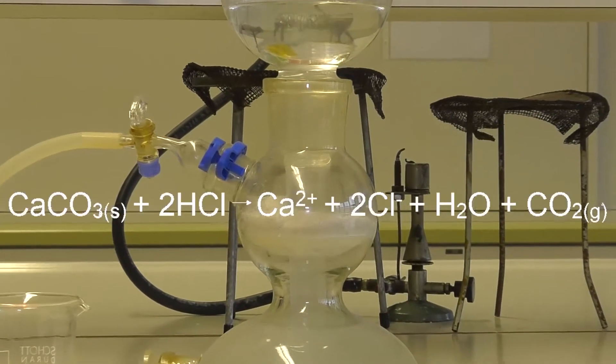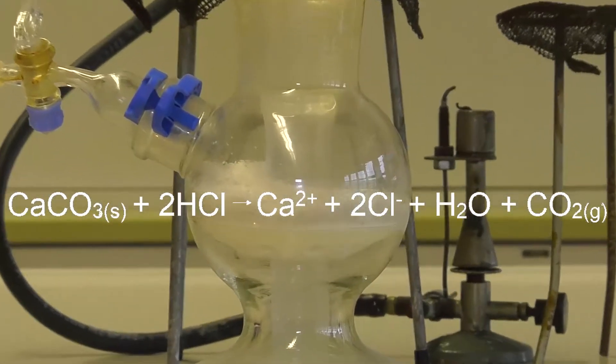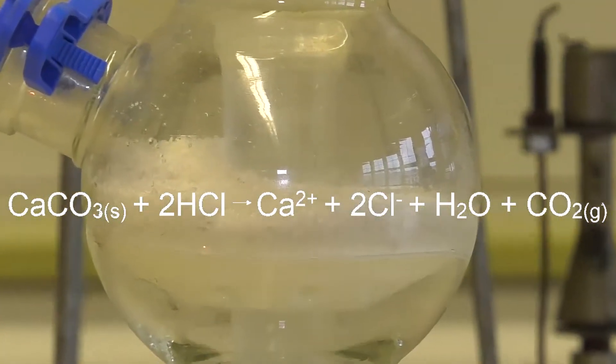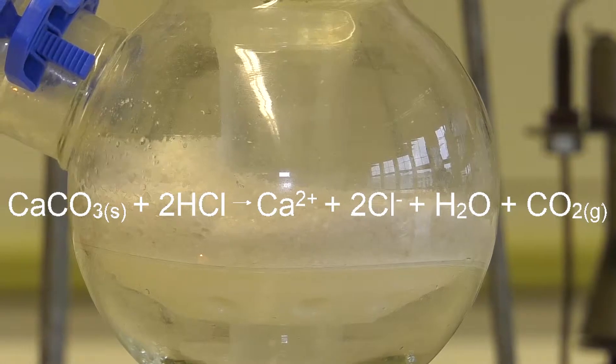you have to produce carbon dioxide with a reaction of limestone and hydrochloric acid. To produce the carbon dioxide, you need a Kipp's apparatus.